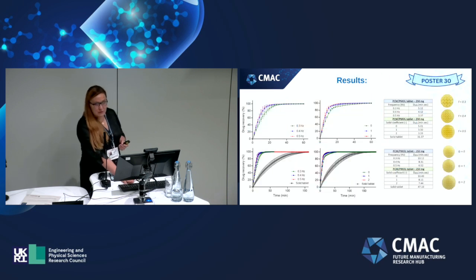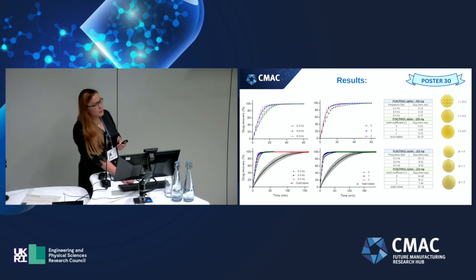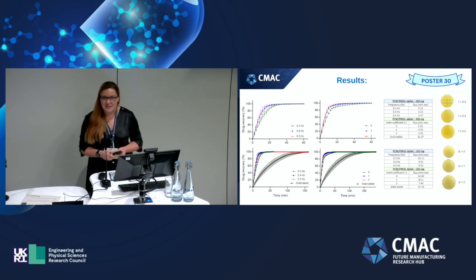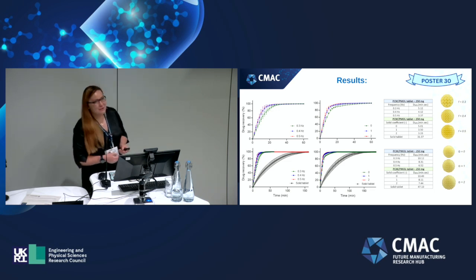So this is one of the results. As you see, we have a solid tablet, and my infill proved that we can accelerate the dissolution profile. But if you would like to know more about results, drop any ideas, ask me questions, or clarify that one size doesn't fit all, then please just pop into poster number 30.